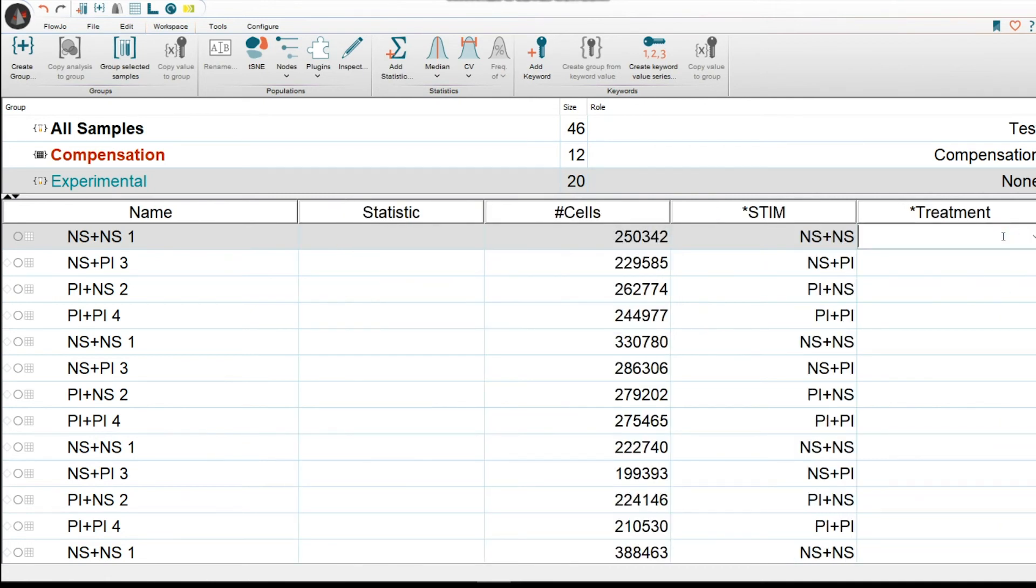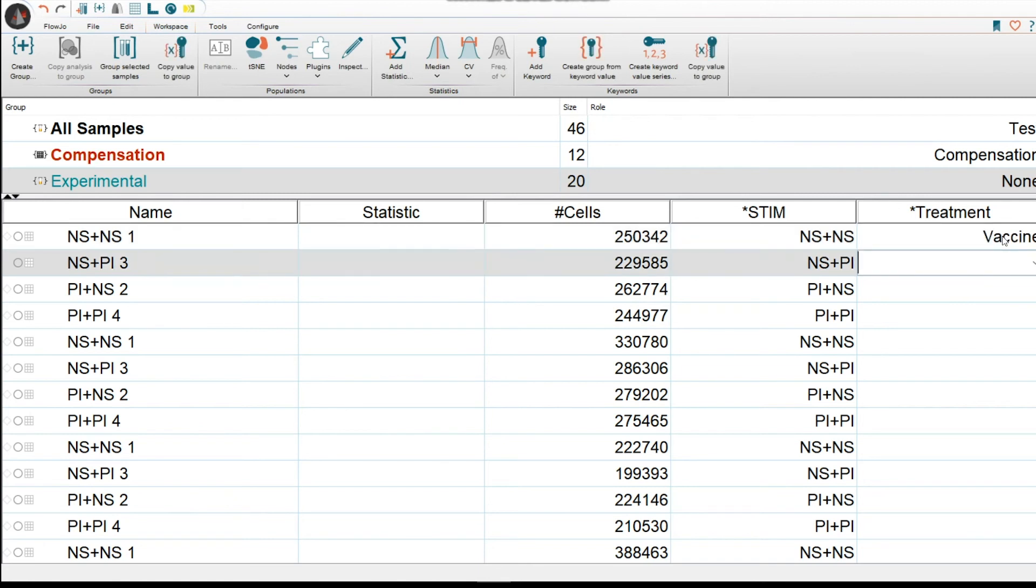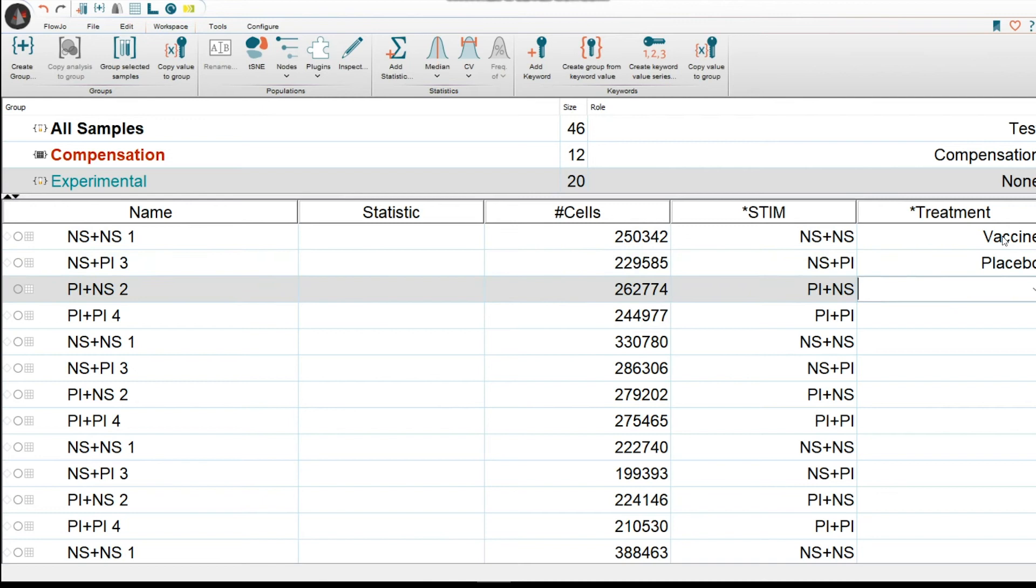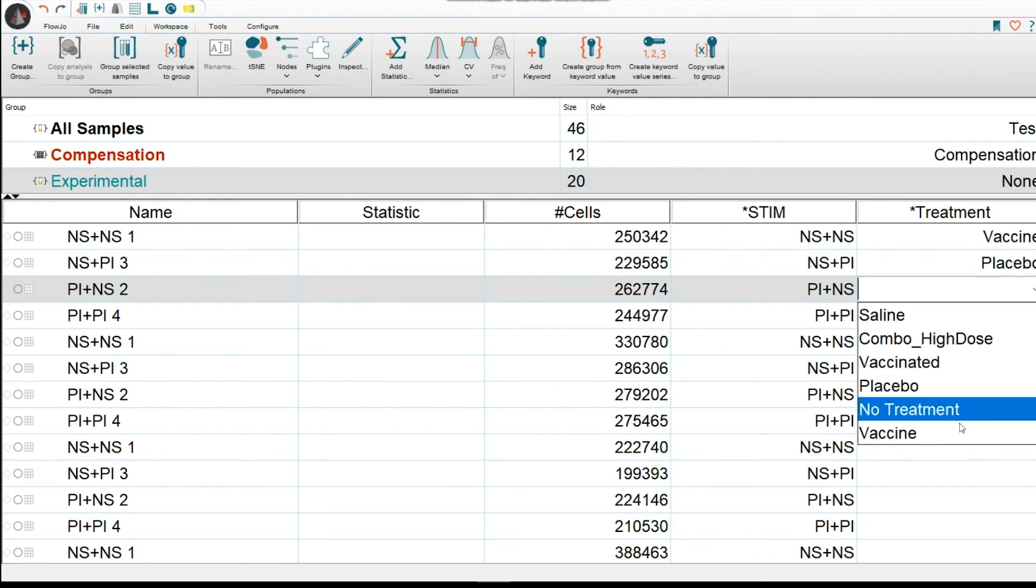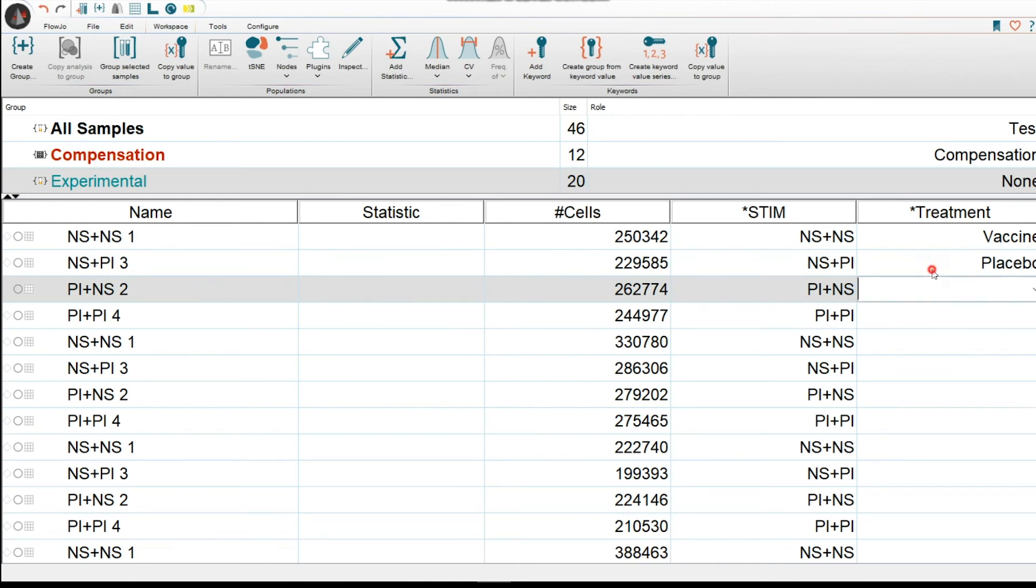Here, I could again enter it manually and I could say Vaccine or Placebo. And for the next one, you could either use a drop-down button, find it. Alternatively, let's say that you knew there was a pattern of vaccine, placebo, and let's say no treatment.